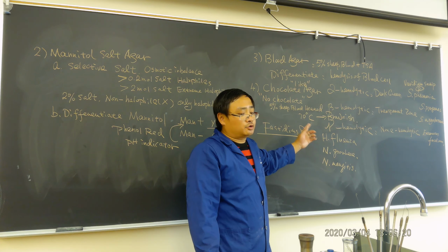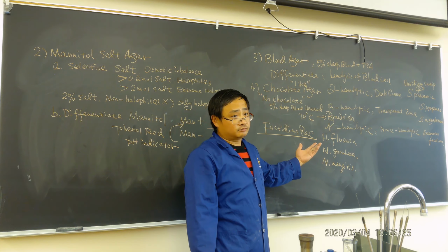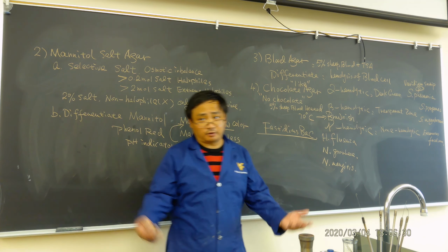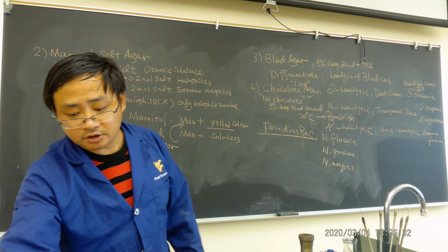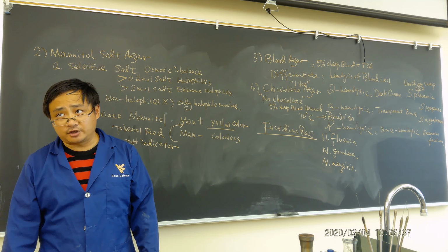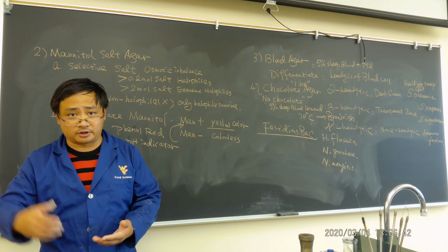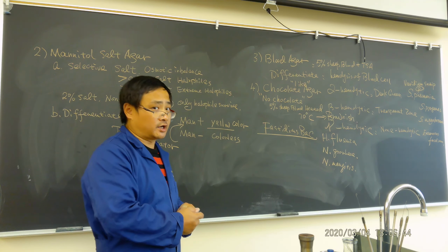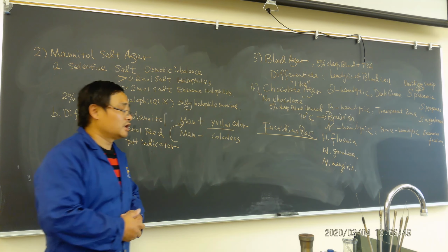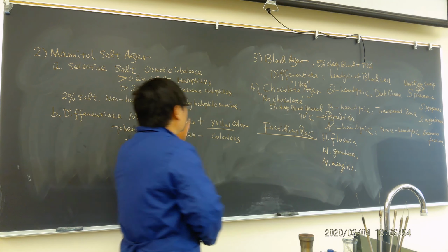Now, chocolate agar you can also modify, becoming modified Thayer-Martin media used for cultivation of Neisseria gonorrhoeae. Is that right? So for people who have a discharge or itching in the urinary tract, especially female, you get a chocolate agar, you can modify the Thayer-Martin media, direct it to a streak plating, and you will see coffee bean shaped bacteria. After it grows, use Gram stain, and you can identify the person has gonorrhea. That's a very easy, quick test. Okay, so this is the introduction for you.